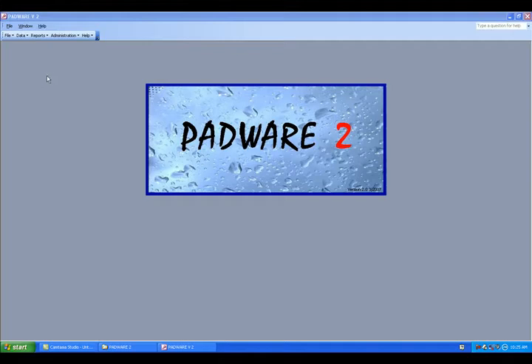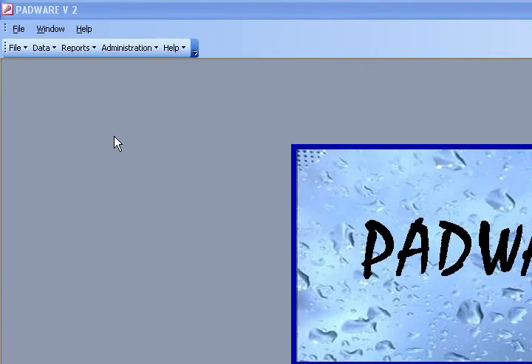Today I want to show you the basics of PADWARE 2. Just a few things to keep our demo movie short. I'll just show you some of the basics. Of course, PADWARE 2 is software that helps us tremendously in the laboratory to be very efficient in reporting drinking water data to Pennsylvania DEP's DWELR site.